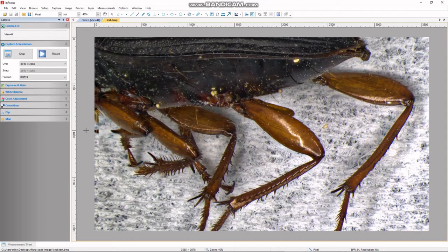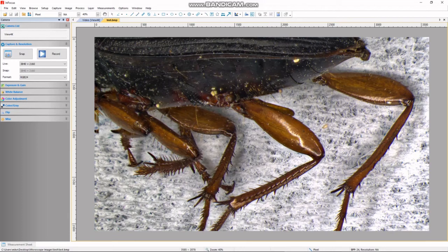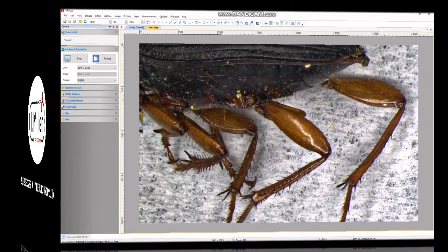An important final note: this process does not give us z-height data. Because we are turning the focus knob by hand, I don't know the exact travel range I covered. In order to get z-height data, you need a motorized z-column. So no z-height data, but a very nice all-in-focus image with no ability to measure in z. For any questions, please feel free to give us a call. Thank you.